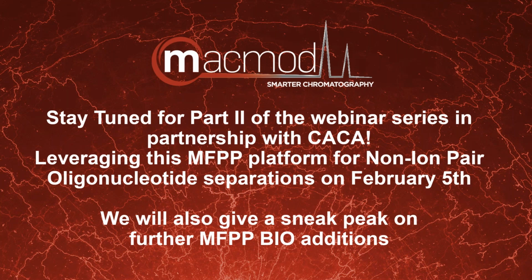Okay, so now I have received another question. What observations have you noticed about the new technology that were unexpected? So the surface area is actually pretty high for a silica-based particle. Some of the more common hybrid technologies can be in the low or high 100 square meters per gram surface area, whereas this is 350 square meters per gram.